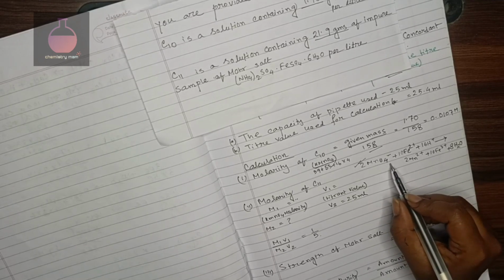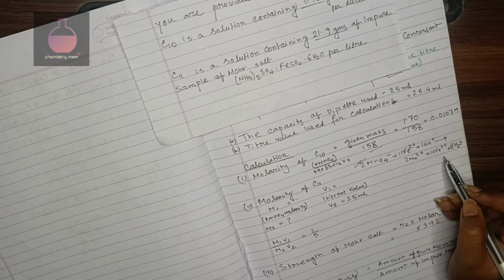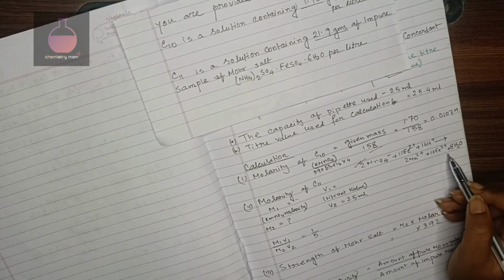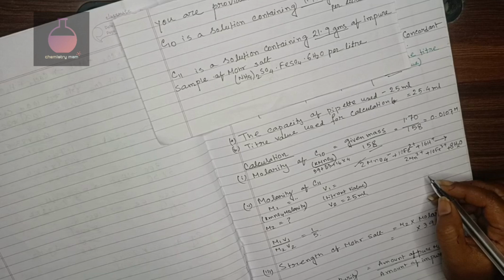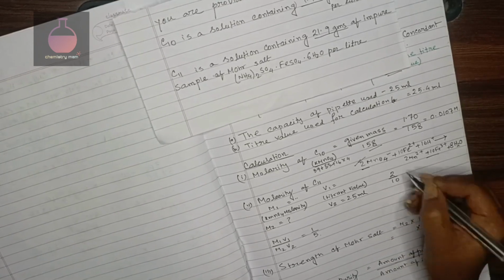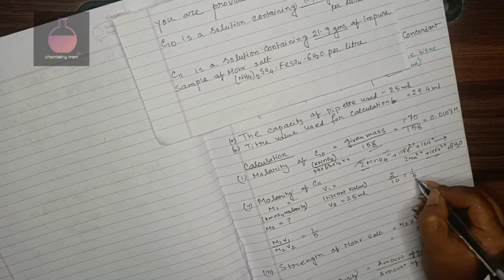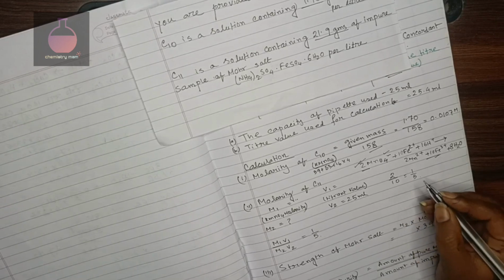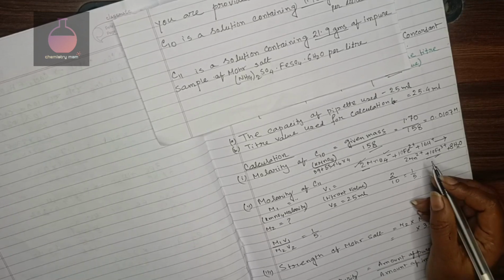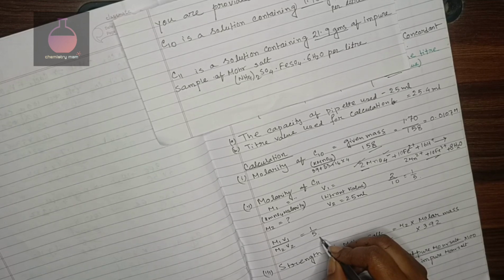Here, MnO4 minus is converting to Mn2 plus, and Fe2 plus is converting to Fe3 plus. So by ionic equation balancing in this process, you will get 10 here and 2 in this case, meaning 2 by 10. This is the most important part. 2 by 10 means 1 by 5, or generally I want to say that 5 electrons are taking part in this reaction. So that's why this 1 by 5 will come.